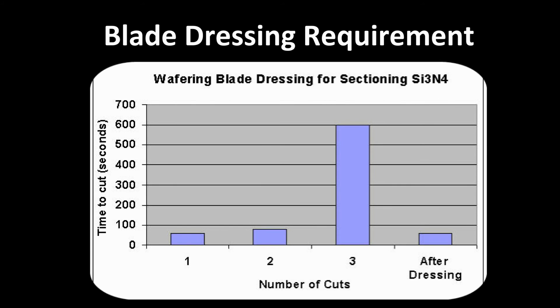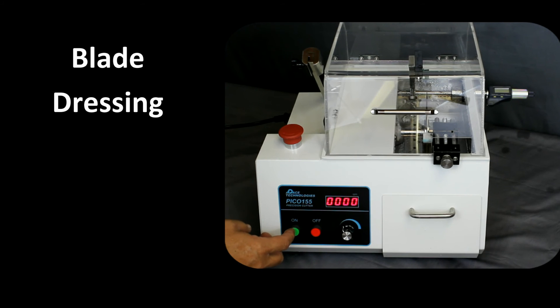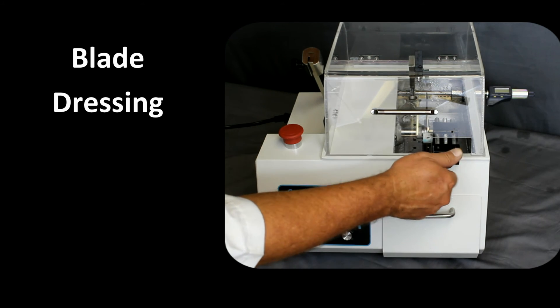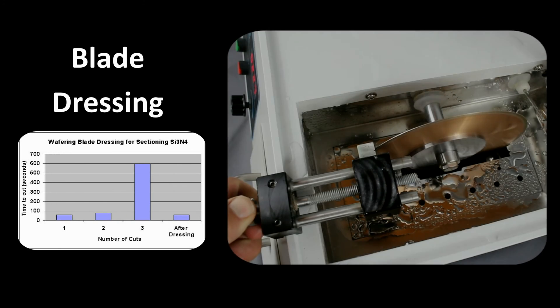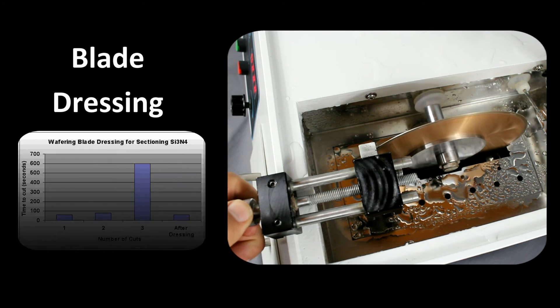This is true. However, since these blades are metal pressed blades — meaning that the diamond or CBN abrasive is pressed into a metal powder — the metal bonding material can actually smear over the blade. The following chart shows that for cutting silicon nitride, the first cut is very fast, and the time required increases significantly for additional cuts. After dressing, the cutting time returns to that of the initial cut.